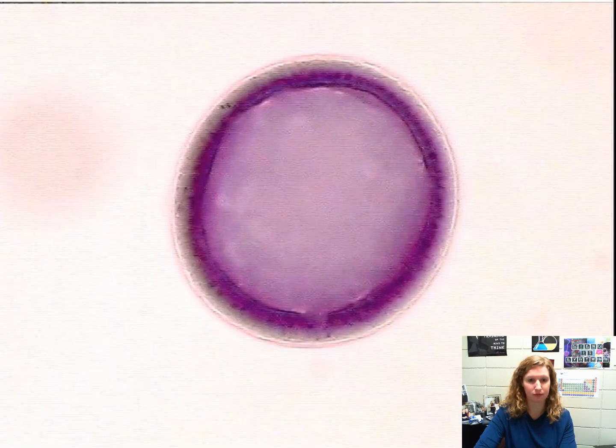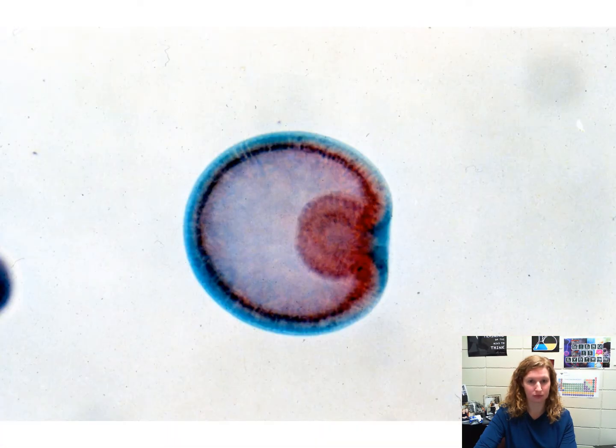Blastula. Gastrula, so there's 3 layers there. Also a gastrula, more developed.